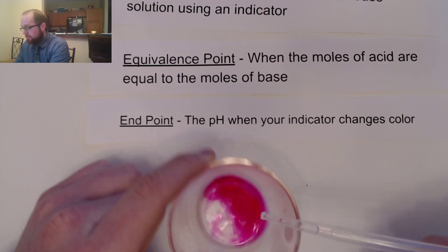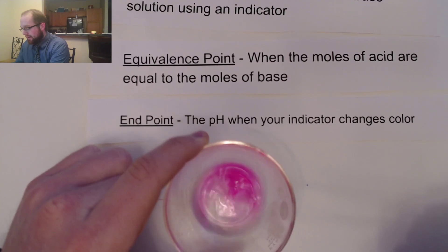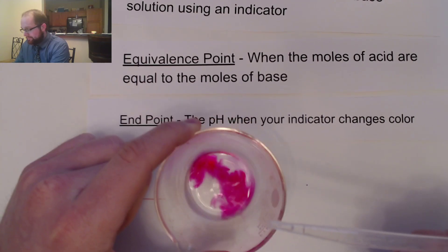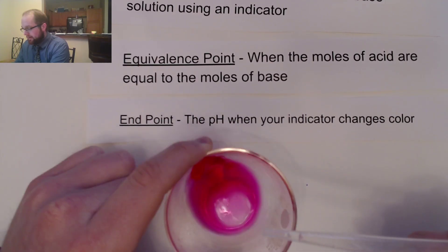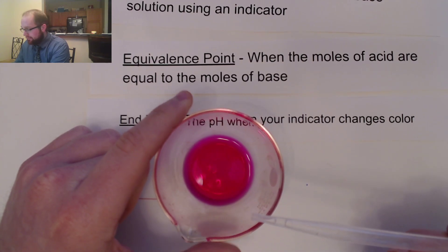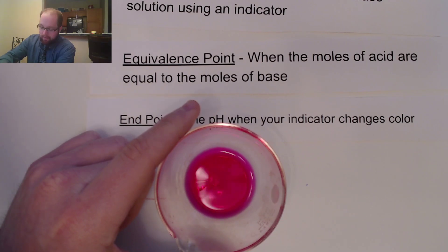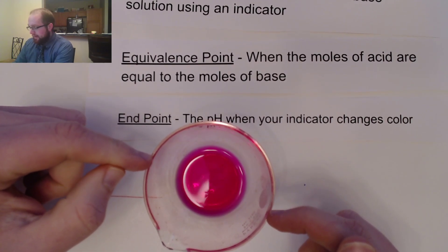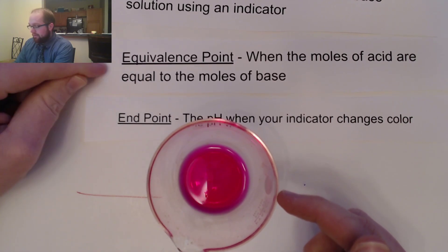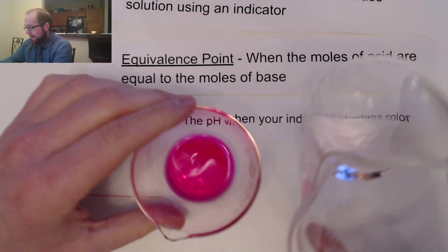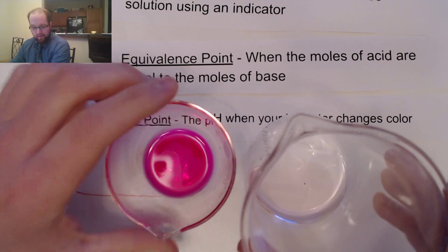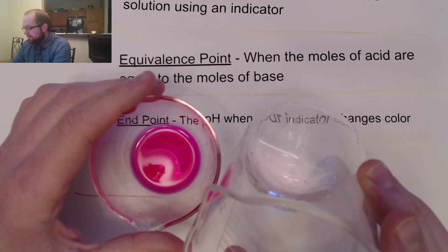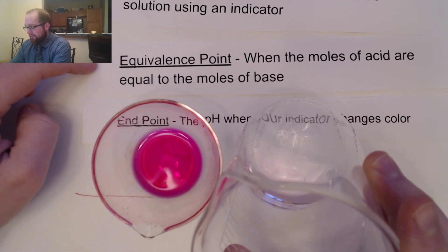My goal here is to not add too much base. Notice how long that pink is staying now — longer and longer. But it's gone again, so I'll add a little more. Notice how that pink is staying now. That tells me I've reached a point where my acids and bases are equal to each other. However, this kind of dark pink, even though it was about one drop, is actually usually a sign that a titration has gone wrong — I have over-titrated and gone past my equivalence point. Ideally, I would want a titration that looks more like this: a very, very pale pink. When we have a nice pale pink, that is a sign the titration has gone nicely and we are basically at that perfect equivalence point.